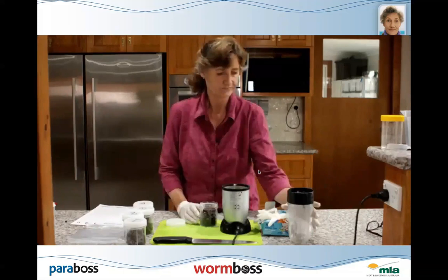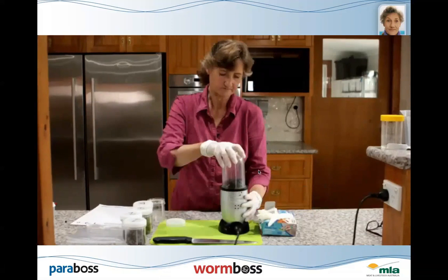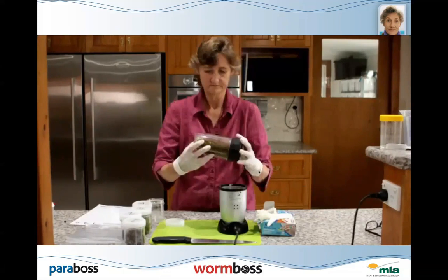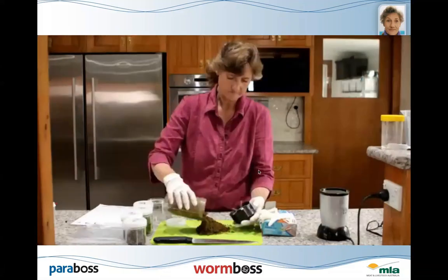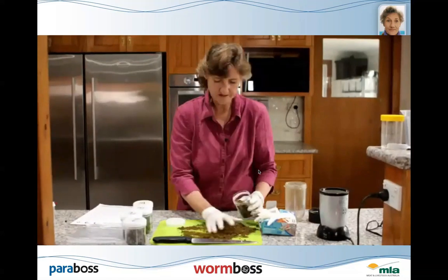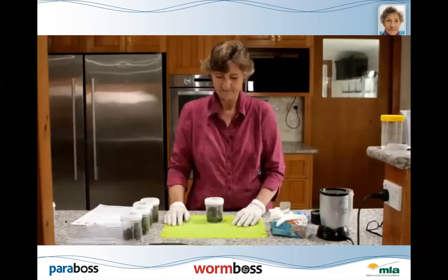This one just happens to be in quite good pellet type forms, and so I can actually mix that up through a blender, one of those little personal blender things, and it only takes 10 seconds, a quick pulse, and you've got a nice mix. This one, it really pulverizes it and comes out sort of dry and powdery. And once you've got that, you can mix it a little bit more, and then you can pop it back into the jar and send that to the lab or you can mix it yourself if you're going to be doing your own tests.